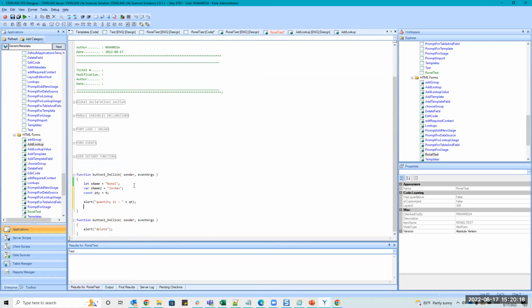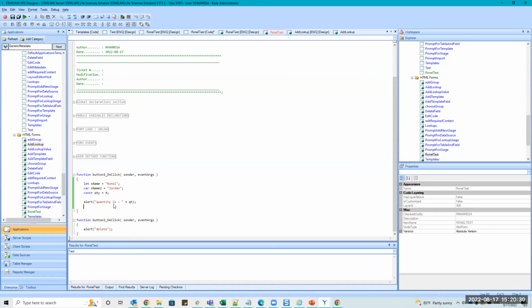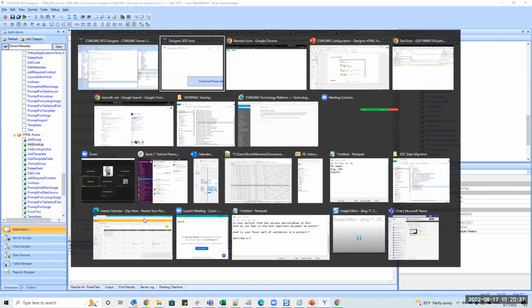Get rid of all this. That should work. I think you're missing the Y in quantity. That's okay, I'll just have a misspelling. Where? Oh, here. No, that's not okay. Good catch. I thought it was in here. I'm like, yeah, it's fine, but no, in the variable, I need it.